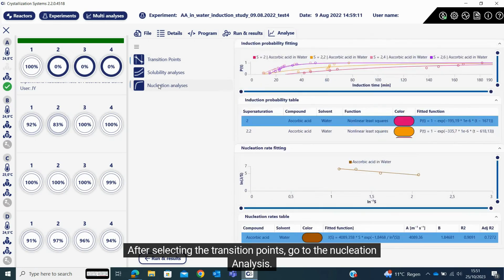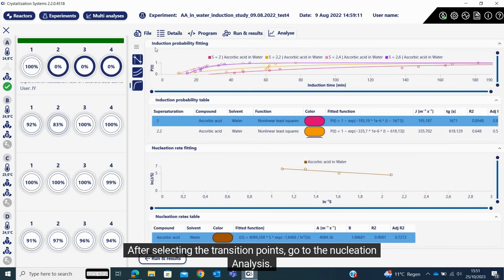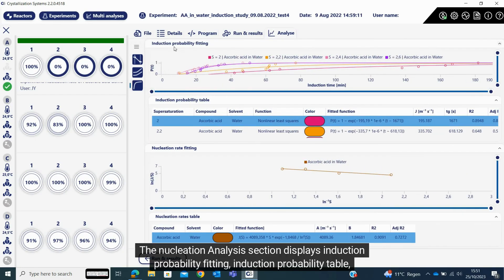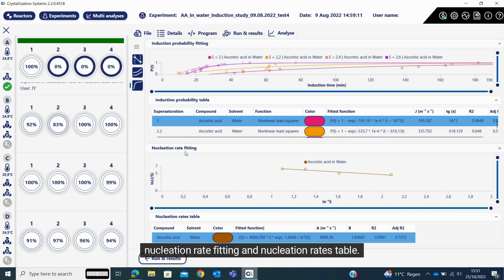After selecting the transition points, go to the nucleation analysis. The nucleation analysis section displays induction probability fitting, induction probability table, nucleation rate fitting, and nucleation rates table.